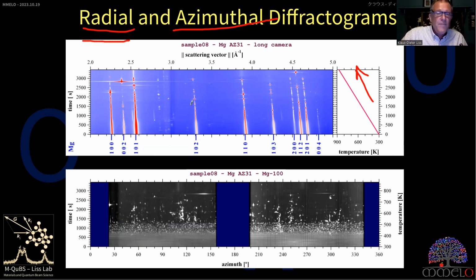But eventually, because we have such a fine beam, we go into the problem of grain statistics, where the grain becomes large after growth, and we don't have all the time intensity diffracting onto the rings. So the crystal may be misaligned, and then we don't get intensity. As powder diffraction people know, if grain size becomes large, we would not have a good powder diffraction pattern.